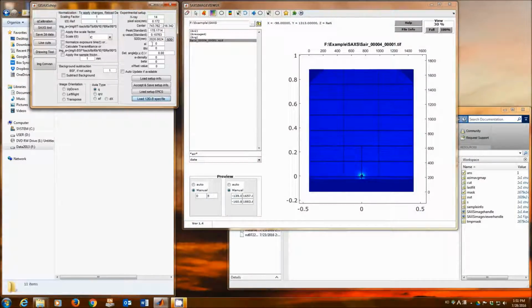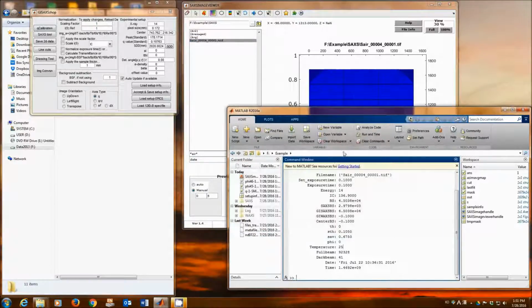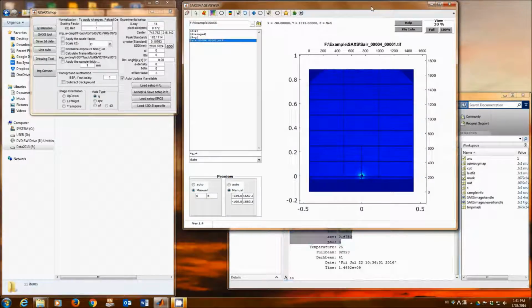And then if you turn this button on, whenever you click the data like this, the software will read the spec file and extract these measurement-related information like the file name, exposure times, photodiode values, X-ray energies, the motor positions, temperatures, and things like that. Okay.